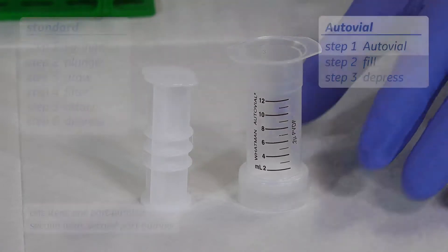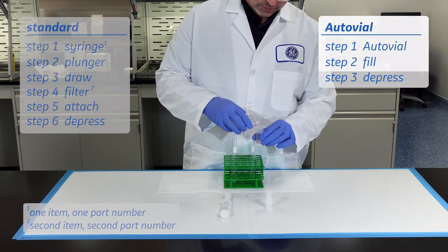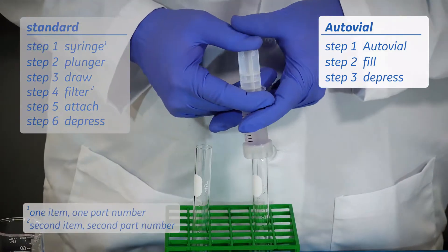Okay, let's start. Retrieve the autovial and fill it with your sample. Now depress the plunger, filtering the sample.